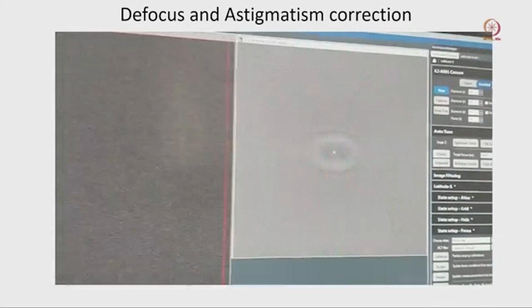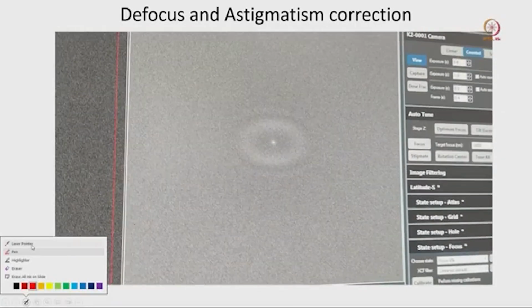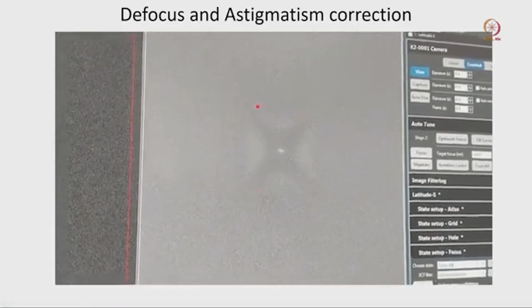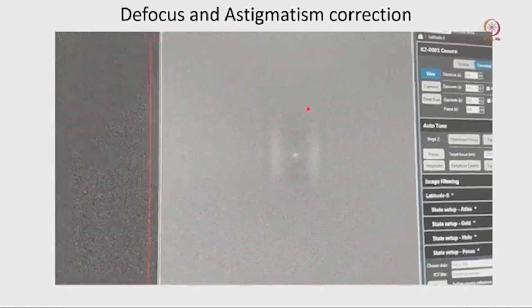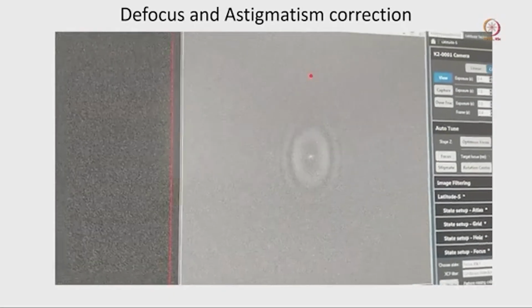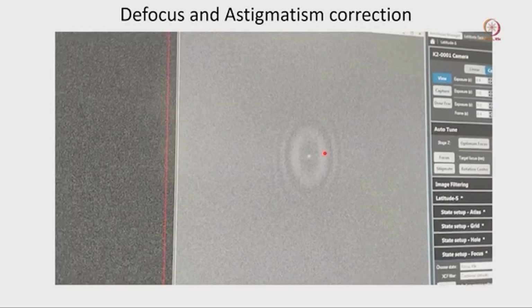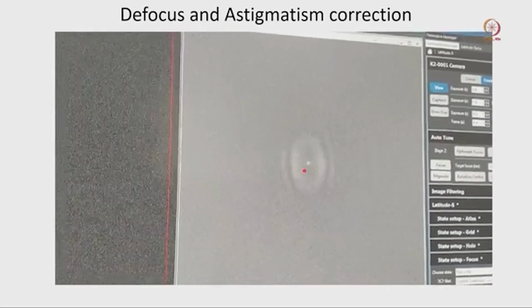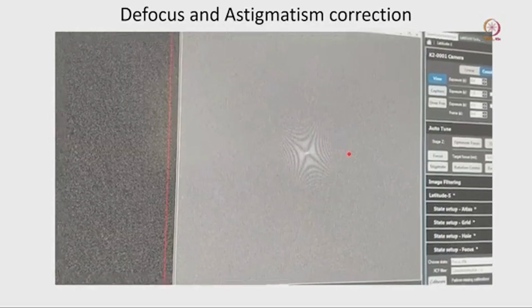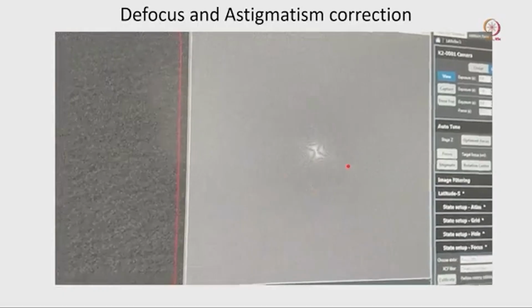Now if you come to this particular point, you can see that at a very low defocus the power spectrum is completely invisible, and even at a particular defocus value, you can see it is elliptical, either along the x axis or the y axis. So definitely there is astigmatism. Whenever we are collecting data, it is better to figure out if there is any astigmatism and correct it. In those cases, we look at this power spectrum and try to correct it.